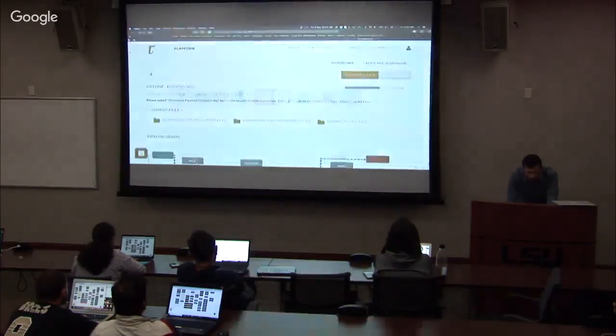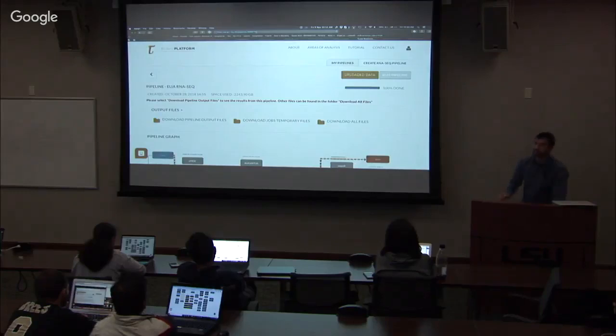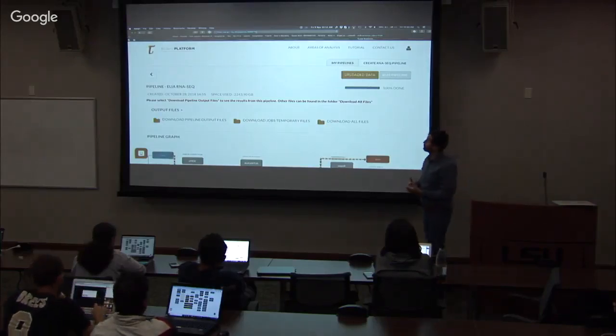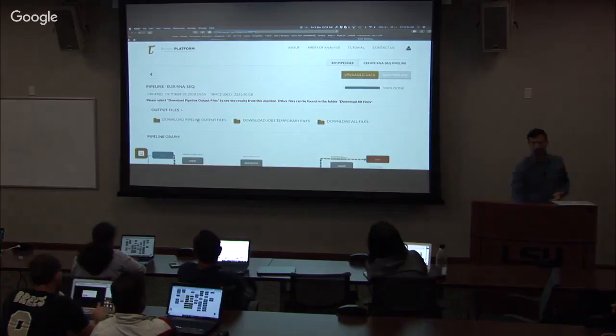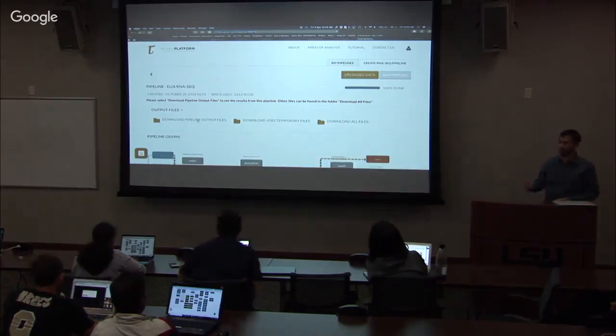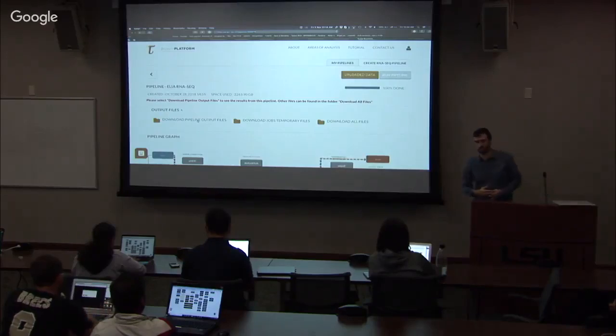If you want to take a look at it, you can go into your pipeline and just change the number at the end to 3886673 at the end of that link. And you should see my pipeline because here you will already have the output files. You also have the output files in the zip archive that I gave you at the beginning.